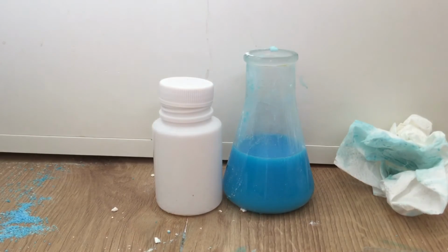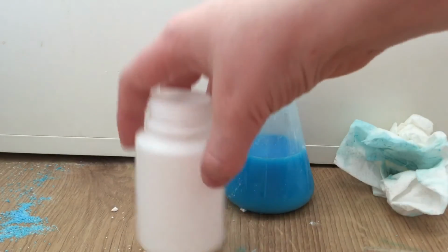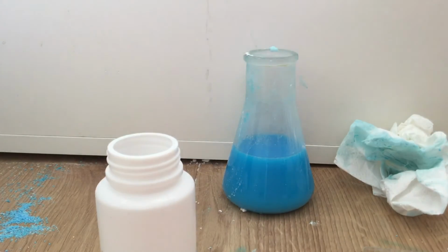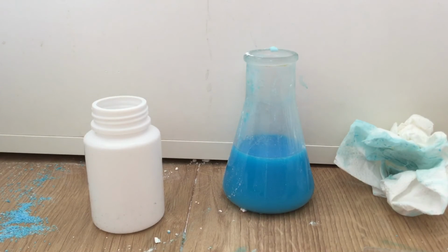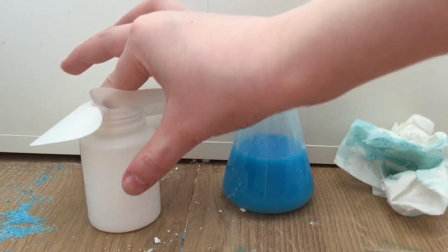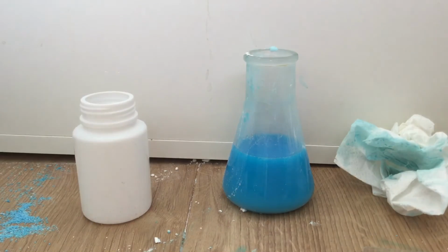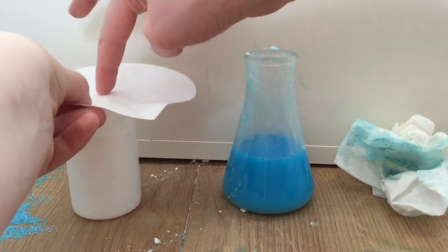So you could use two layers of filter paper. This stuff isn't that hard to filter though. And even in some of the water, even some of the precipitate separates from the water going through filter paper. So either you do two at once, or you could filter it once and better filter it again.